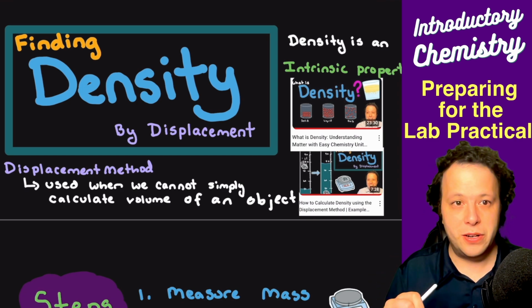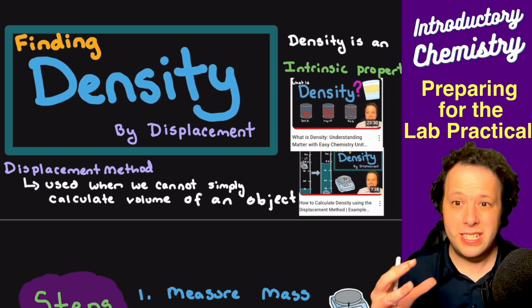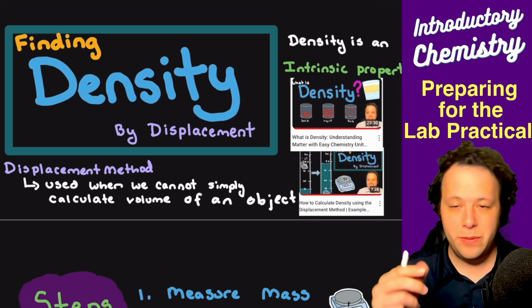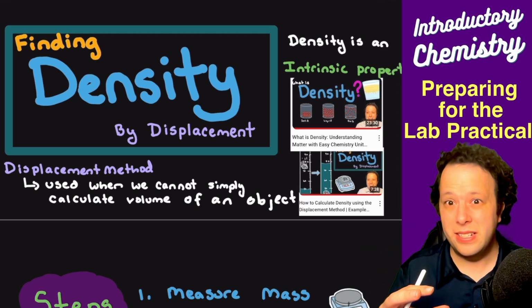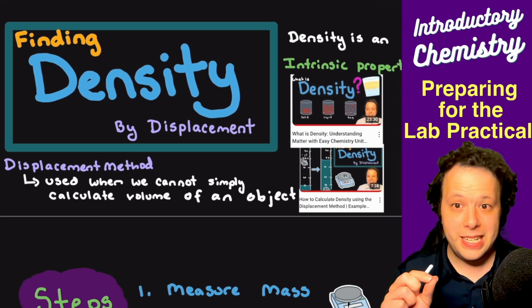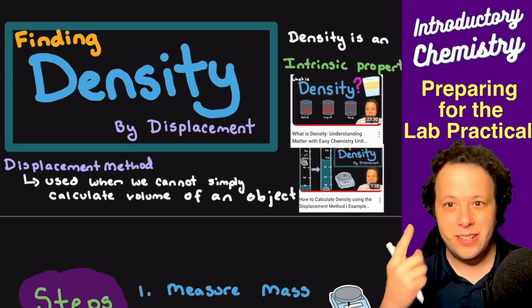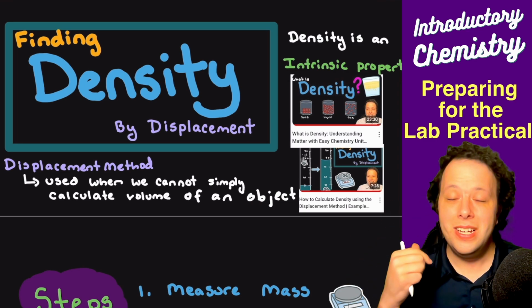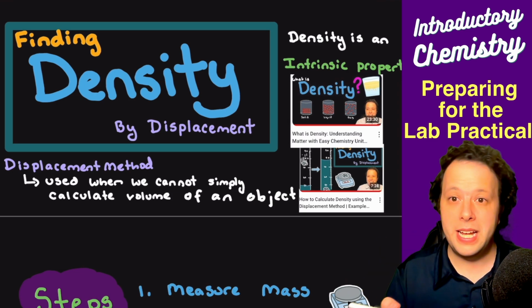The biggest thing is the displacement method was one of the things that you used. So you measured the volume via length, but you also did the density by doing the displacement method too. When we went over density, it is what we referred to as an intrinsic property. And you're like, oh crap, I forgot about this stuff. So this meant that no matter what the mass was or the volume, it would always have the same density.